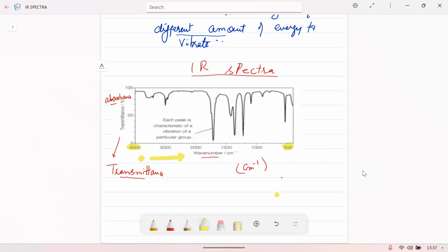The next thing is these numbers may not be in a sequence. So it's not like fixed numbers with a difference of 1000 or 2000. You just need to read this. We are going to focus on these peaks. Where are these peaks? That is more important for us.